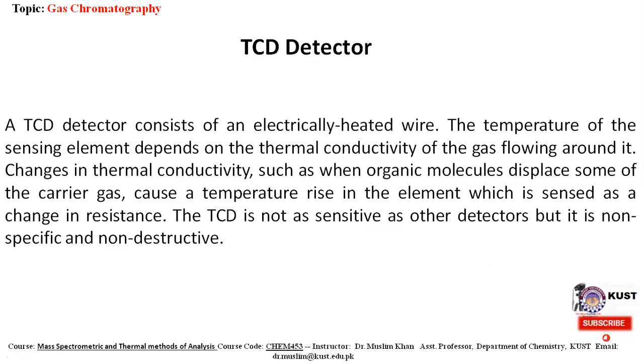What is a TCD detector? A thermal conductivity detector consists of an electrically heated wire. The temperature of the sensing element depends on the thermal conductivity of the gas flowing around it.